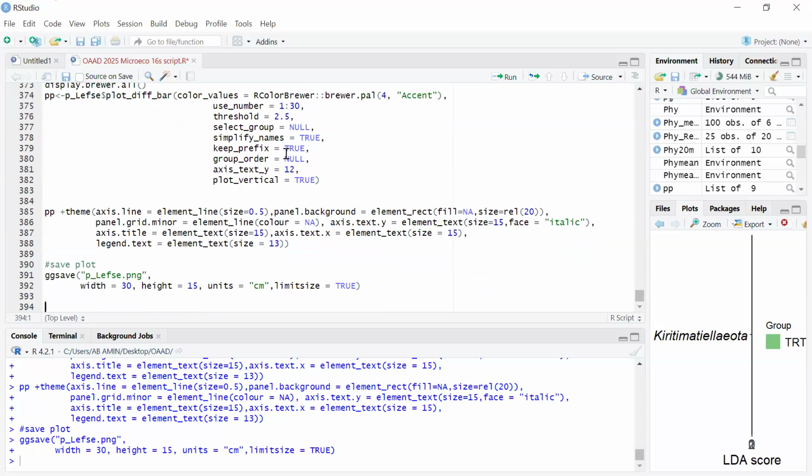Thank you, Dr. Samela. Yes, sir. Thank you very much, sir. I think we have done well. You took us through the alpha and beta diversity and some of the things that we can actually visualize to interpret our microbial data, 16S microbial data to be precise. So I don't know if we have some questions from the audience, or if someone needs any clarification on what you have done so far.